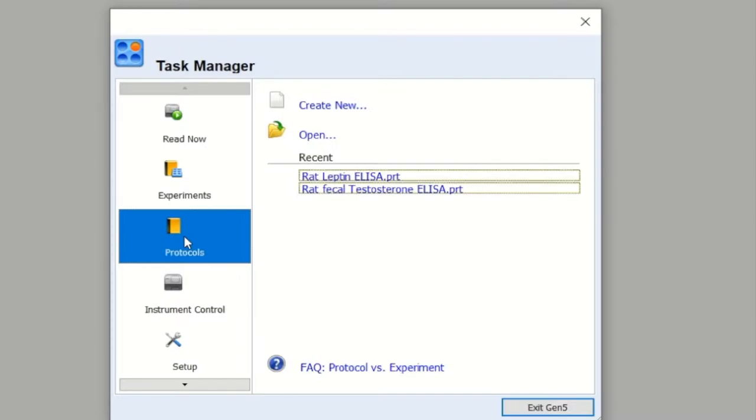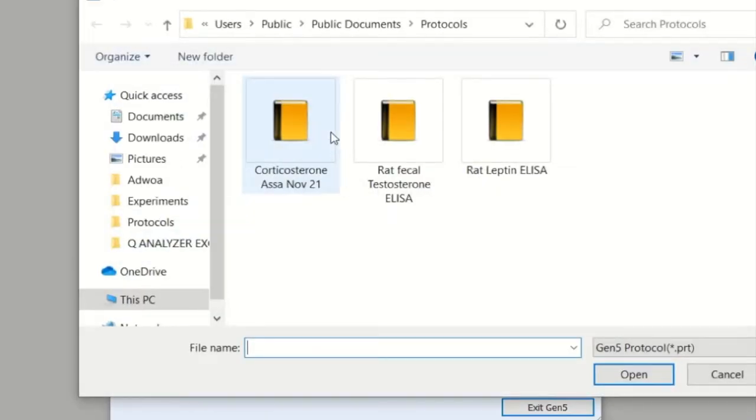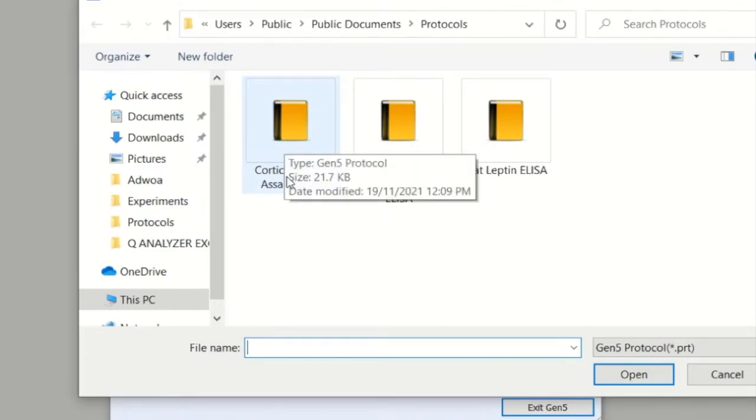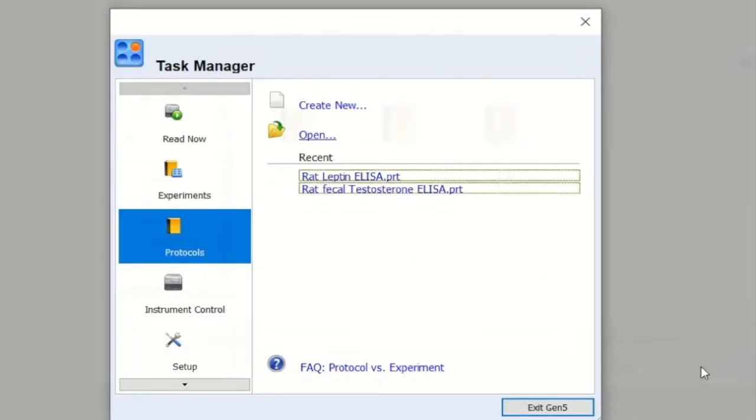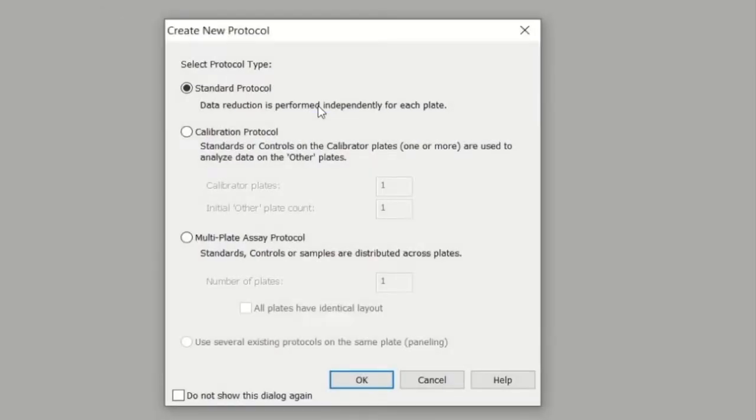Within protocols, you can then access an experiment. If you go to Experiment, you can call up a protocol to use for that particular experiment. Of course, you can have multiple experiments using that one protocol. When you first start, obviously you need to create it, so go to Create New.